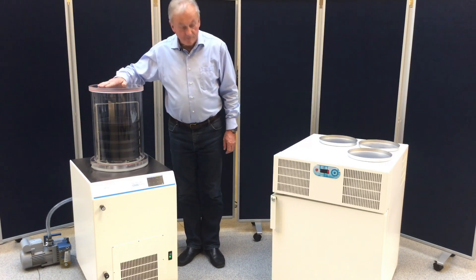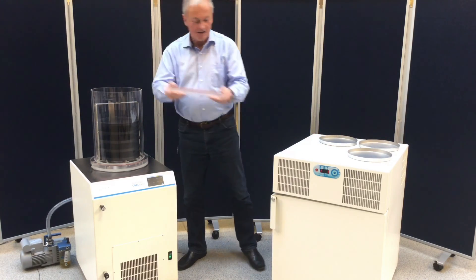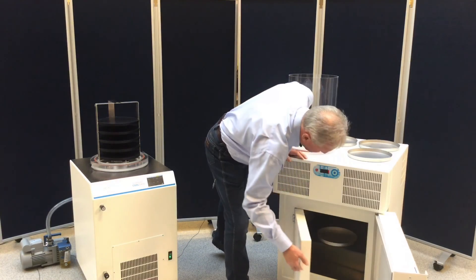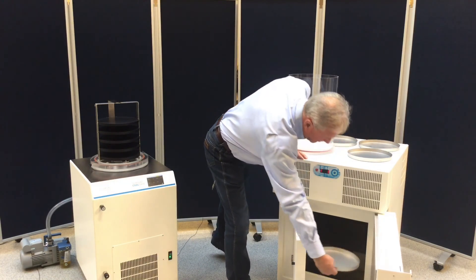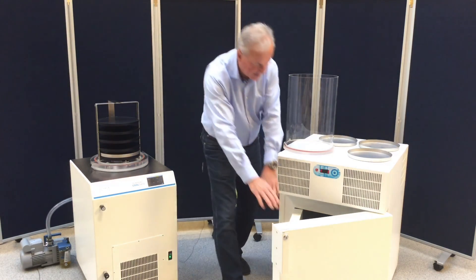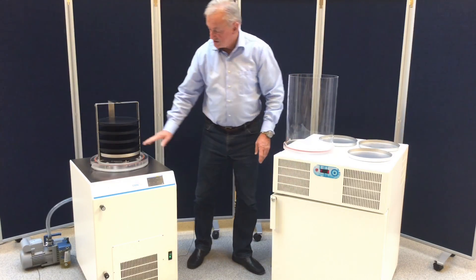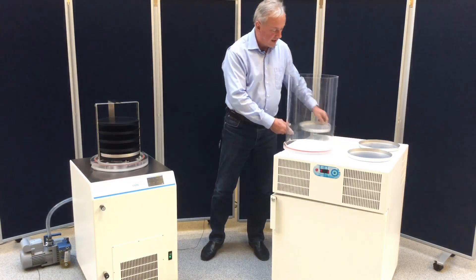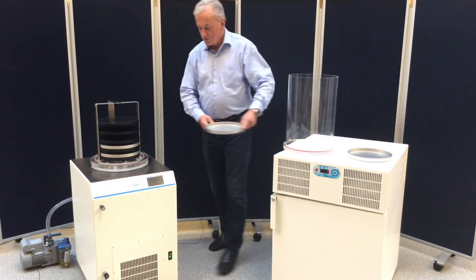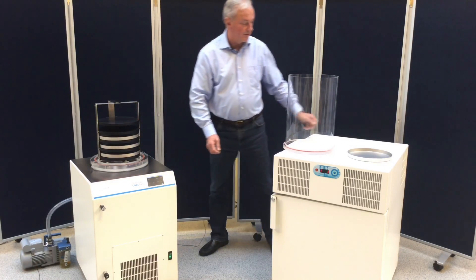So now, three hours later, our sample is frozen. We will get it prepared, take off the lid, take our frozen sample, and place them inside the shelf. It is quite important that you do that rather quickly so your sample does not start melting. It is important that you bring the pressure down below the eutectic point as soon as possible.